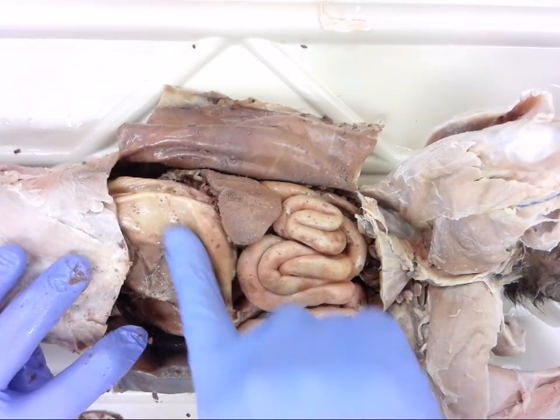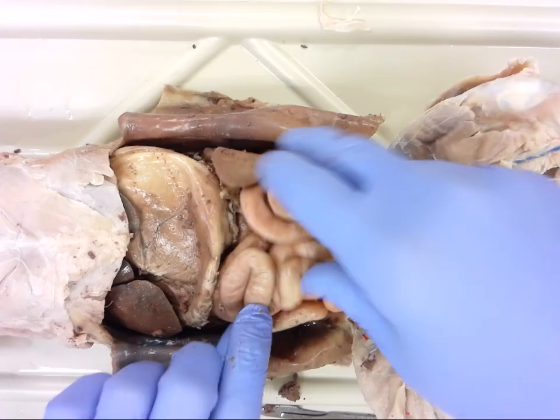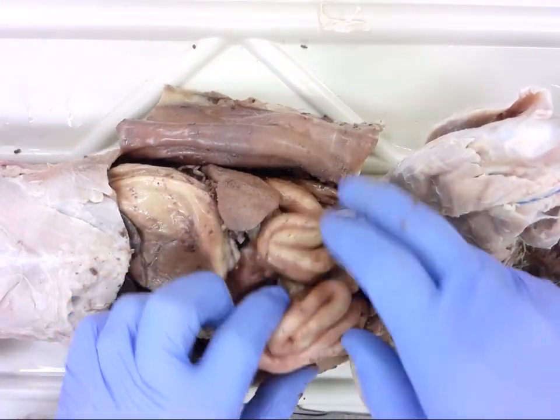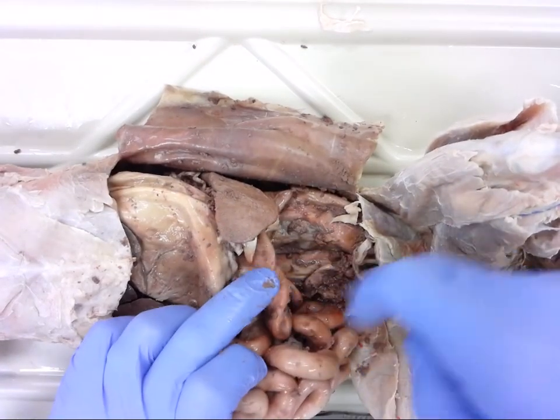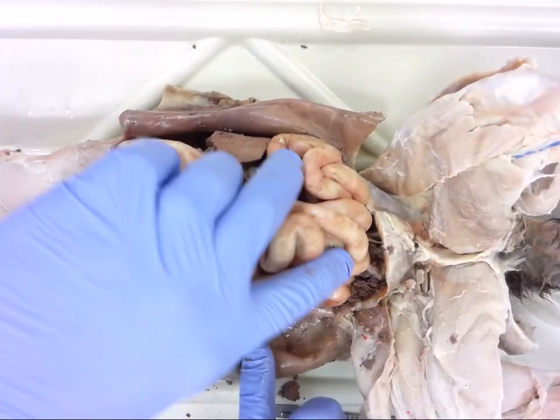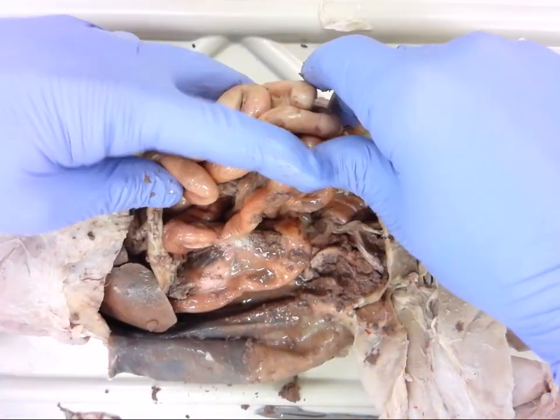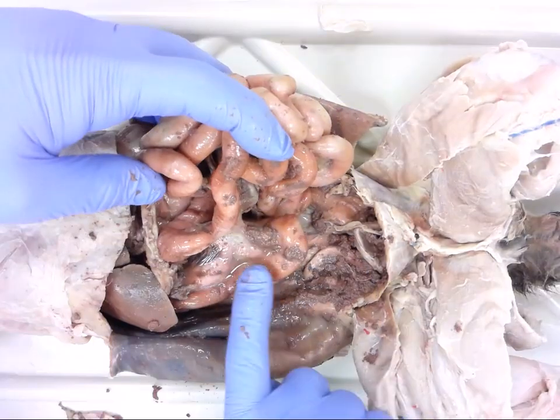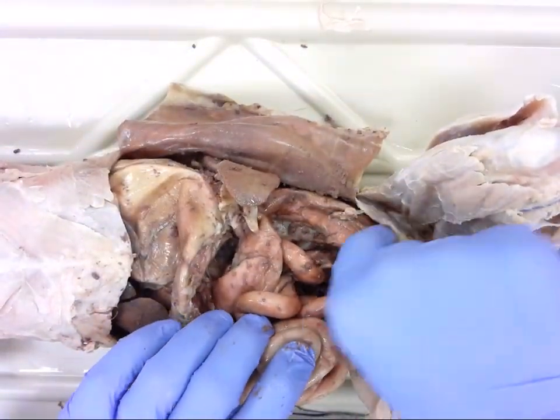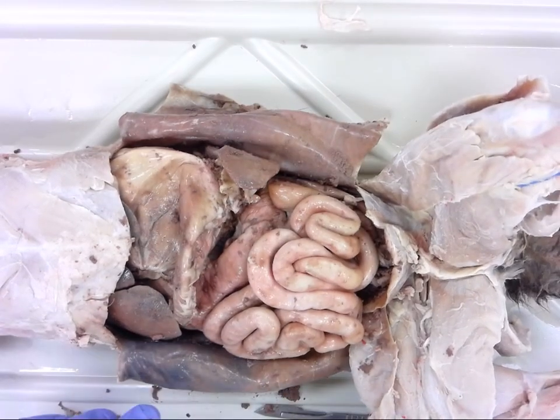Once we follow that, we'll see the other parts here. You have the small intestine, which is mostly right on top. In order to find the large intestine, we're just going to move this out of the way, and you can find it as it travels deeper in the abdominal cavity on each side. So you have to pretty much get that small intestine out of the way. All right, and then it progresses on down toward the rectum and anus. So that is a very brief general view of the digestive tract.